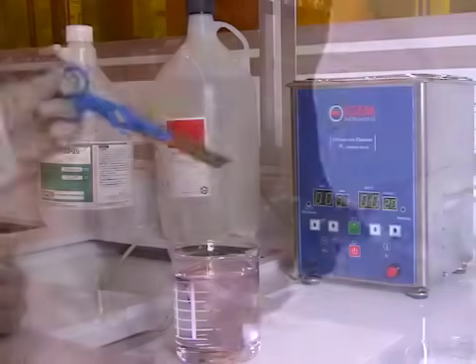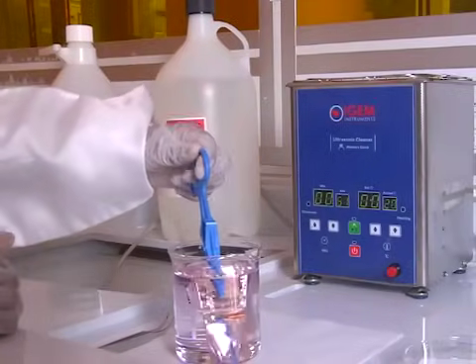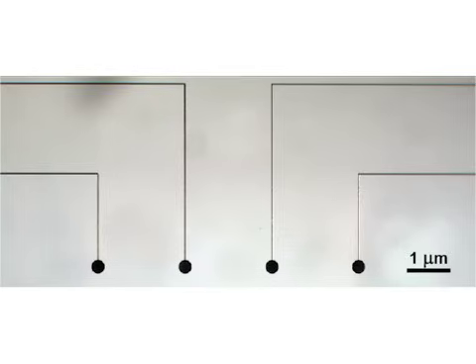After deposition, the photoresist is removed to expose the gold patterns. The gold patterns can then be used for the controlled assembly of cells or as electrodes for bioelectronics.